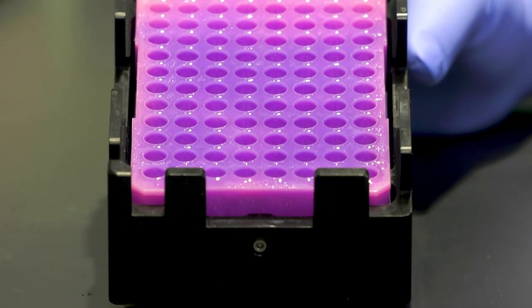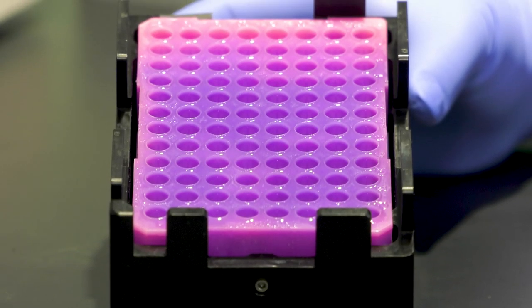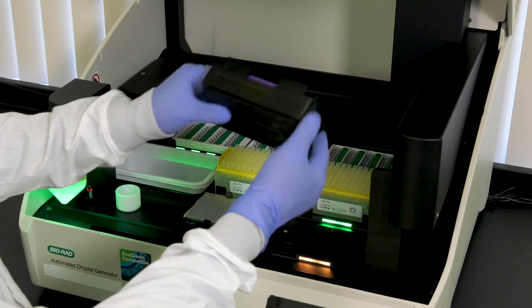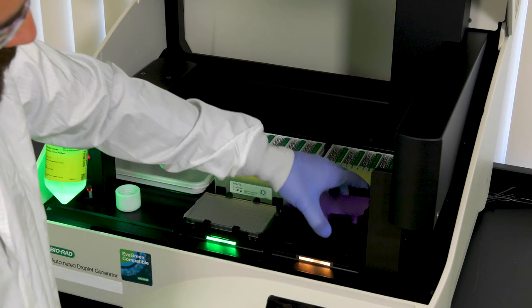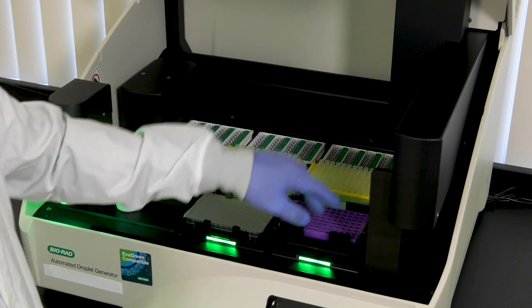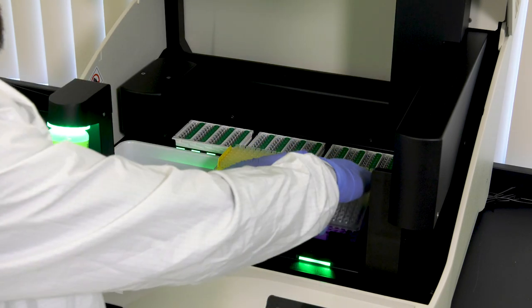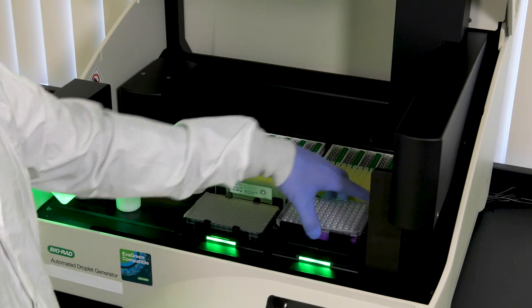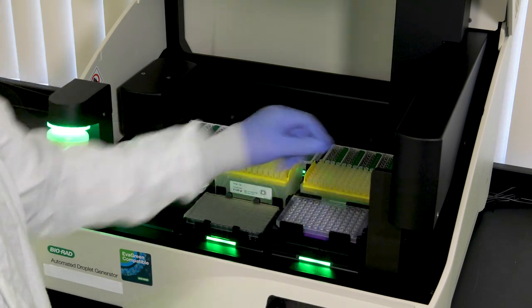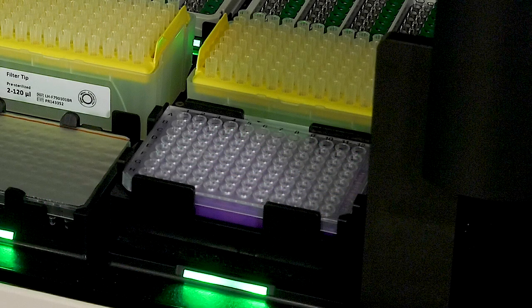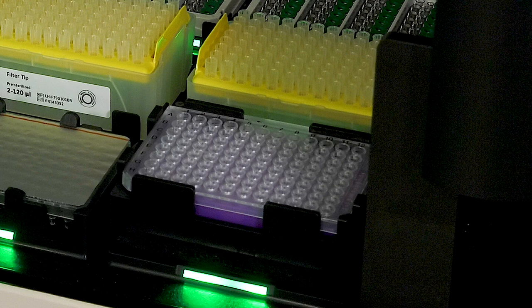Place the cooling block onto the front of the instrument and place a brand new DD-PCR 96 well plate into the cooling block. This is the plate where the automated droplet generator will deposit the droplets that are made from the reaction mix.